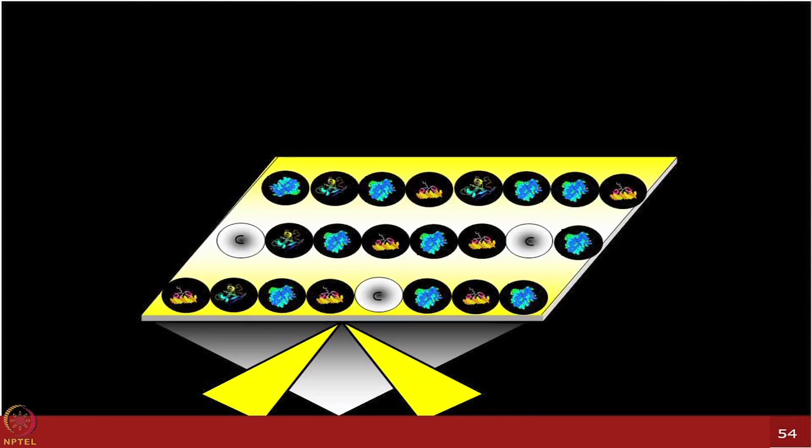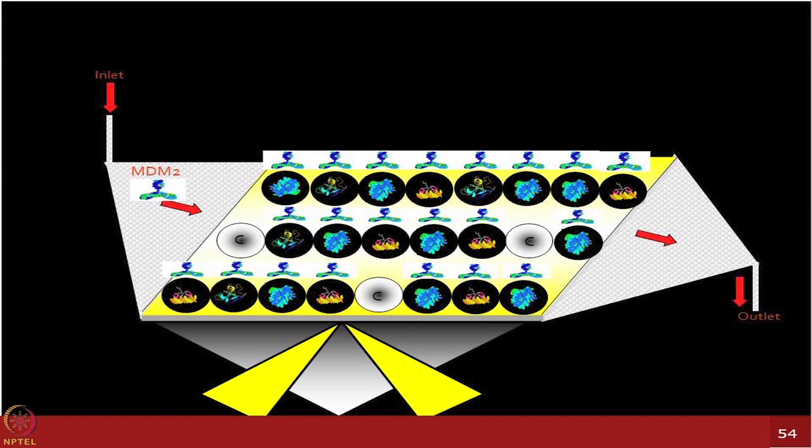The next experiment planned was more of a high-throughput experiment, which was very challenging to do on the prototypes we had available. One of the companies in Cambridge at that time gave a lot of clones of p53 mutants. These are all hotspot mutants of different p53 regions, to test how the MDM2 protein binds to the wild type of p53 versus different mutant forms of it.